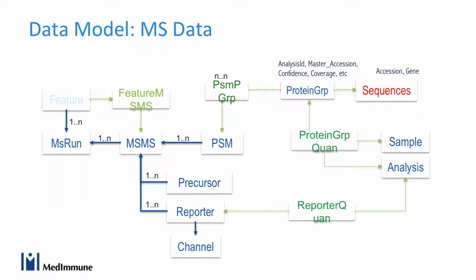I'm not going to go through how we organize the mass spec related data, except that this particular diagram tries to model what we call TMT labeled quantitation data, so isotopic labeled proteins. We also want to extend this set of tables to label free or even simply qualitative data. But in essence, this will encapsulate a typical discovery proteomic data type.